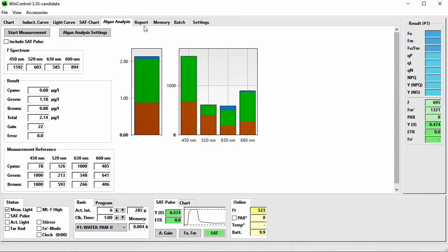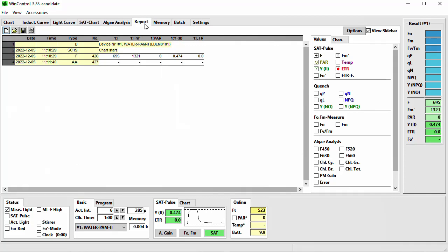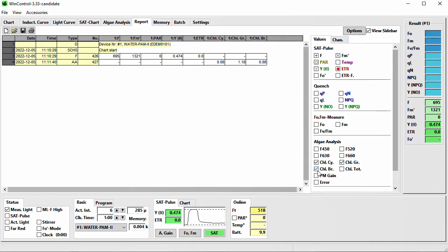All results will be listed in the report — an algae analysis is labelled with AA. In the sidebar are the different parameters; a little further down you will find the algae analysis section. F450, F520, F630, and F660 are the determined fluorescence values of the respective wavelength. Listed here are the chlorophyll A concentrations of the algae groups — cyanobacteria, green algae, brown algae — and the total sample, along with the photomultiplier gain and the fit error.